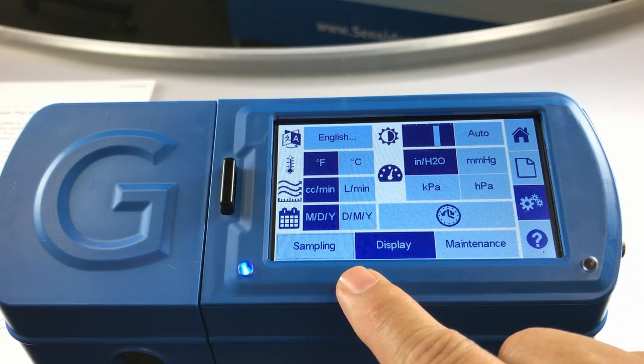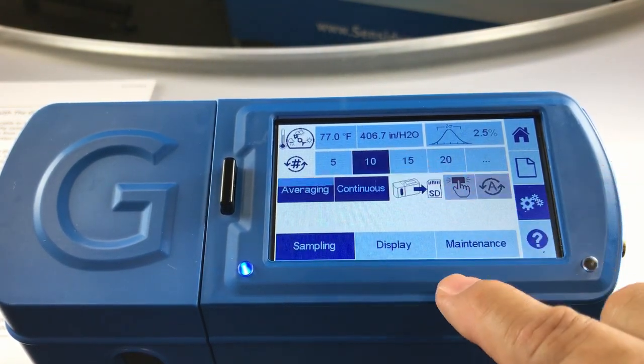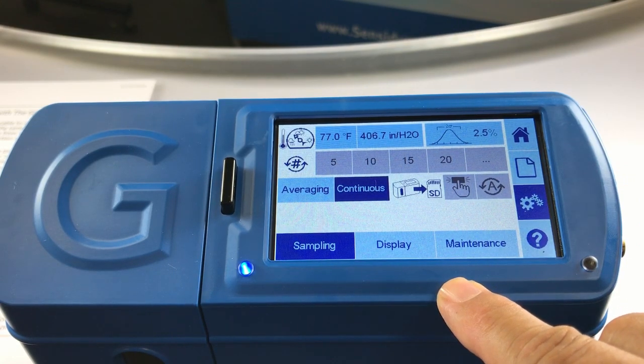Additionally, we'll want to enter the sampling tab and switch it from averaging mode to continuous mode to continue with our SmartCal operation.